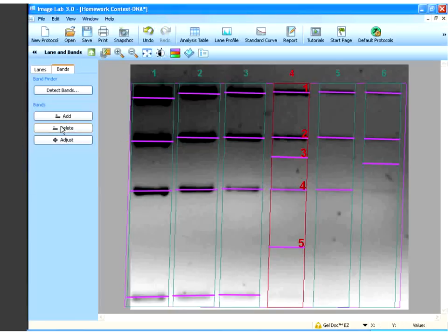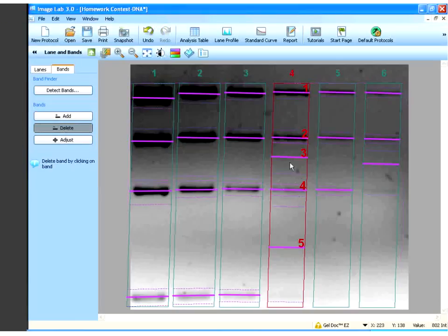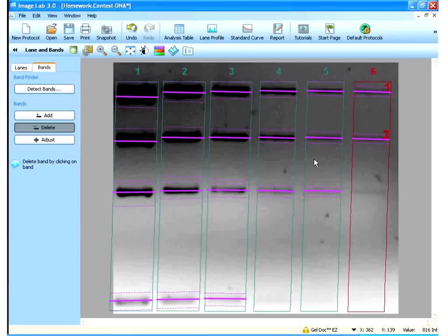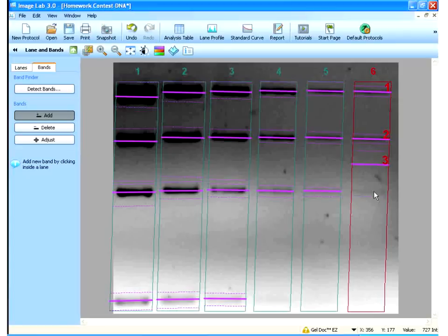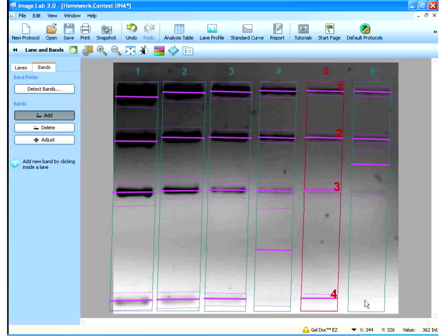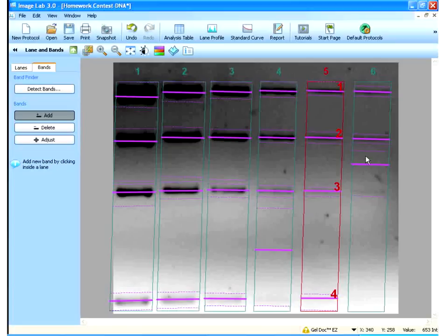Now I'm going to delete certain bands that I'm not interested in. And I'm going to add bands where I am interested. Now, you can see, I wanted the band to appear here, but it went up there. We'll click fast. Same thing here. This one did OK. And then this one, I can't even see a band there. OK. So, this one too. We need to make some certain adjustments with the ones that I've manually added.